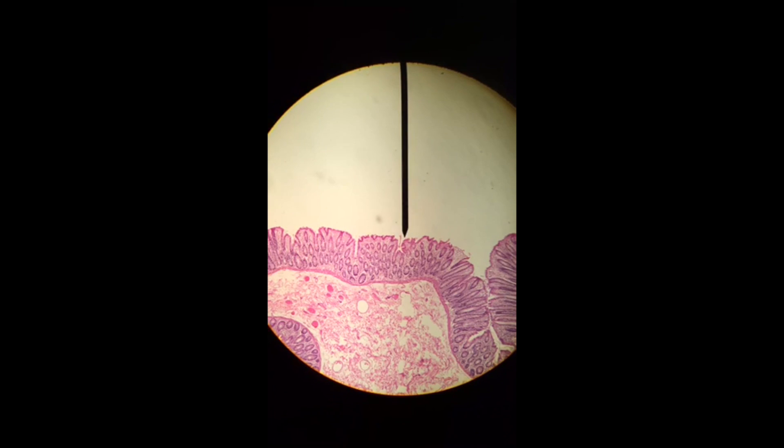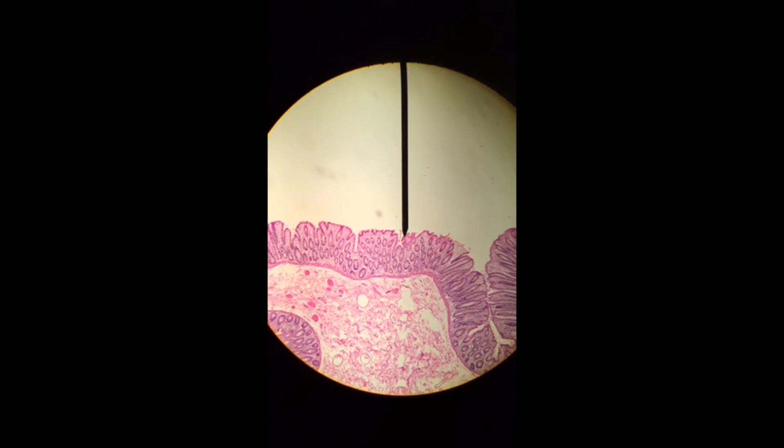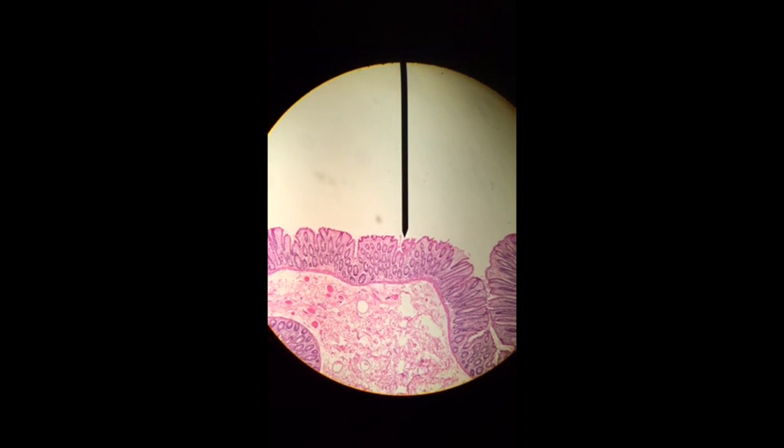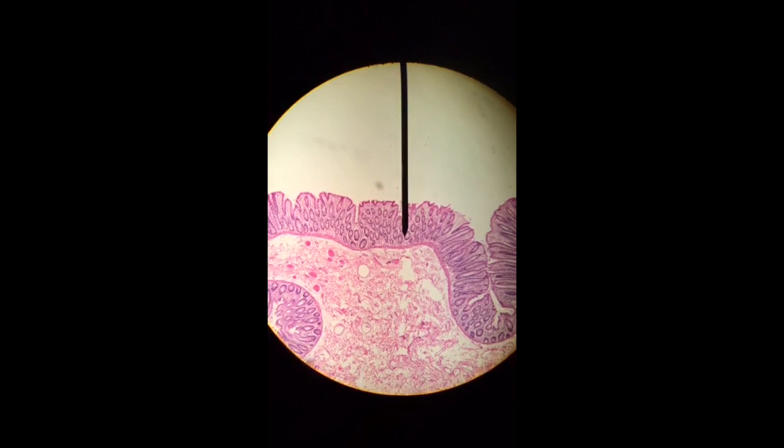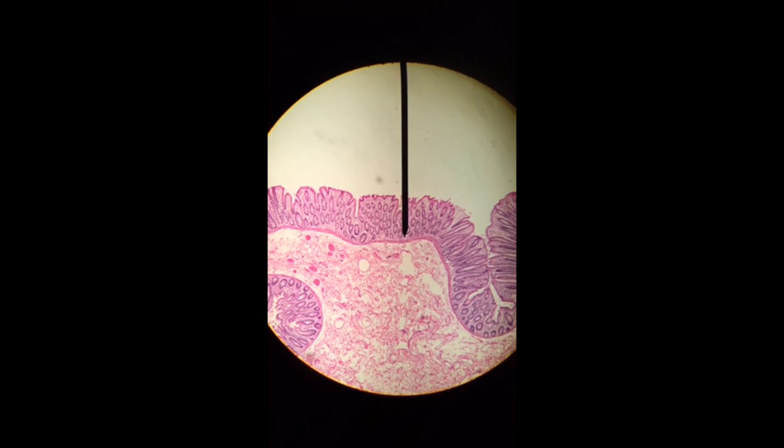We're looking at the histology of the large intestine or the colon. We're going to work through our four layers. The first of which we're pointing at now is going to be our mucosa epithelium.